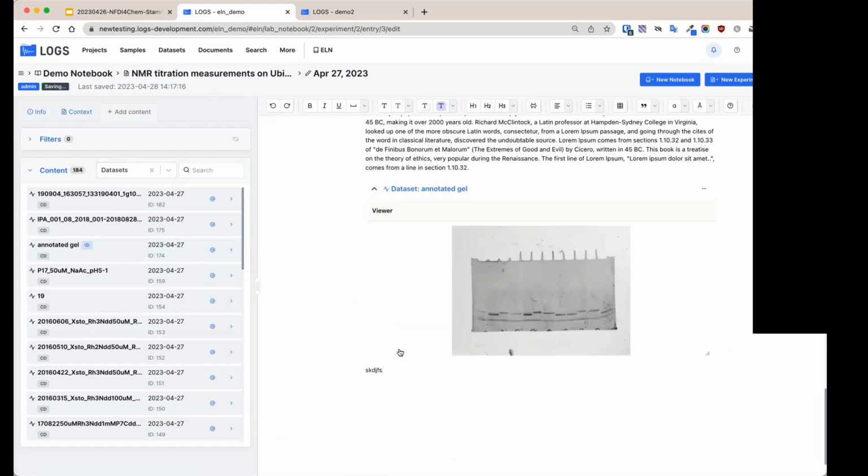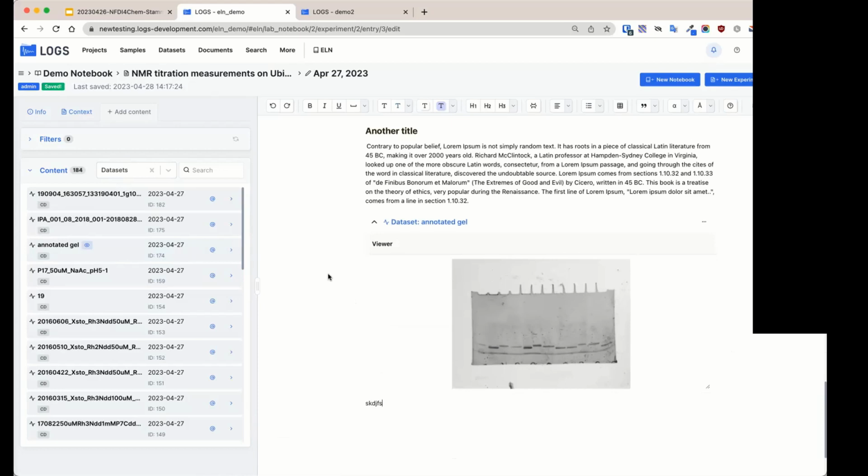And the beauty here is that you could, for instance, export this as a PDF and keep the link. And if you give this PDF to somebody, then they could click on the link, and of course they have to have the login details, etc.